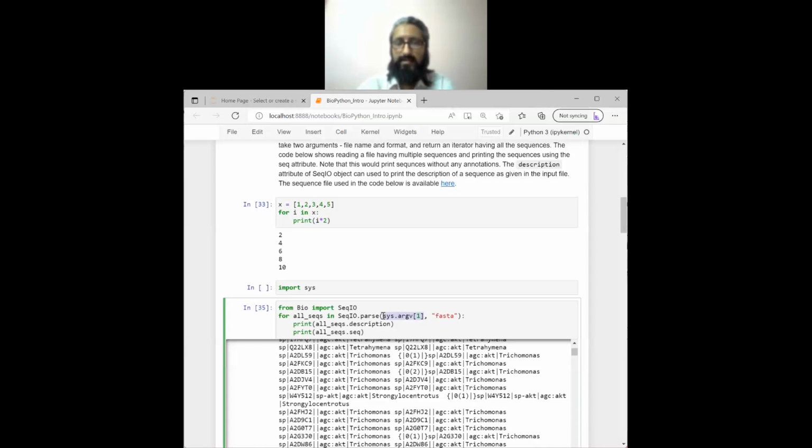I know this is slightly advanced, but maybe you can go through the book. I think in the files chapter I have discussed this, so you can read through it, I mean, how it executes. So this is the way of asking the user for the file rather than specifying it within the code. And of course, most of the time we do not specify the file within the code. We ask the user for the file name, because the file name can change every time.